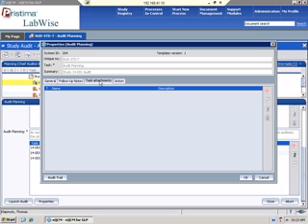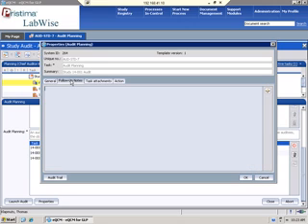If there's any additional tasks within the system, again, as a process management system, you can create other tasks that the auditor may have to do while he's conducting the audit. And then this shows any actions that are due as part of the audit. So if there's any CAPAs or any other actions that need to be done as part of the audit.